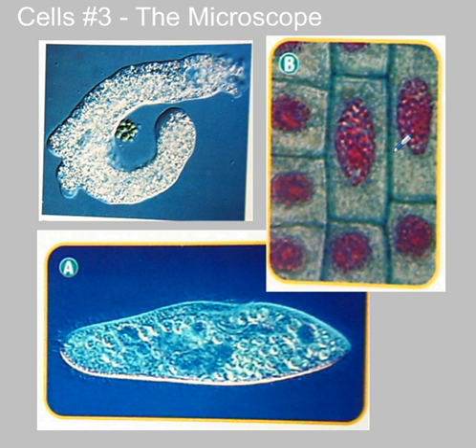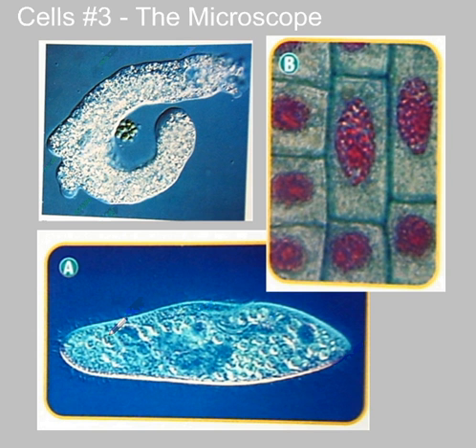These are the kinds of images that you might see through a compound light microscope. Here we see some microscopic organisms — single-celled organisms. This one would be an amoeba, and this is a paramecium. These are creatures you might find in pond water. And these are what some plant cells would look like under a compound light microscope.